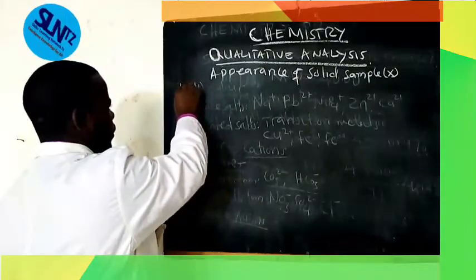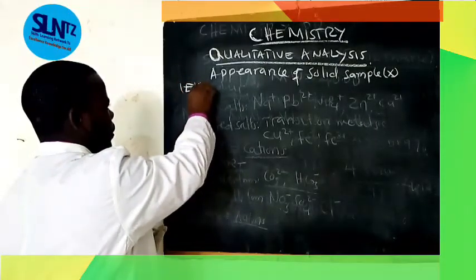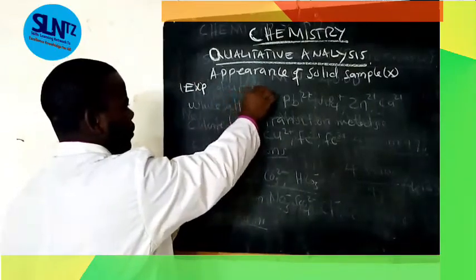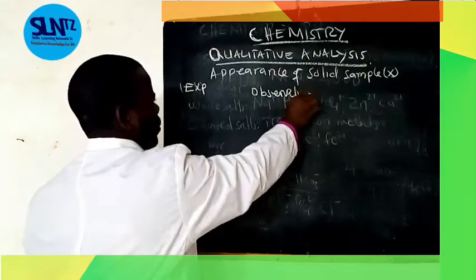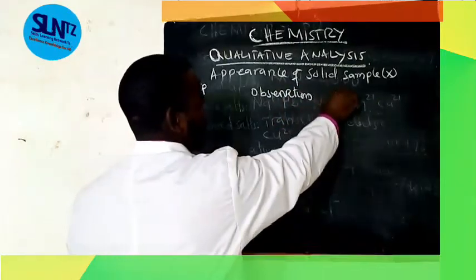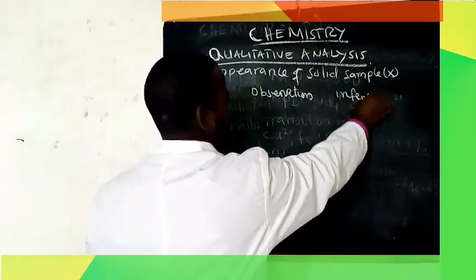This is the experiment, we have the observation, and then we are going to write the inference.